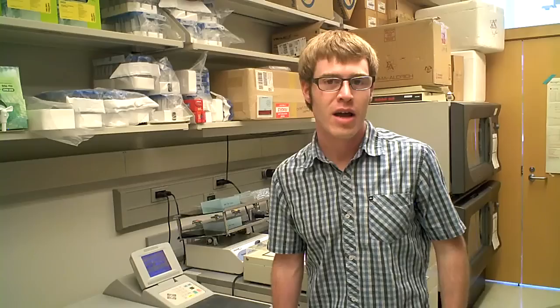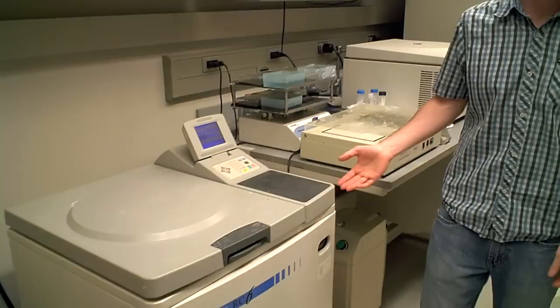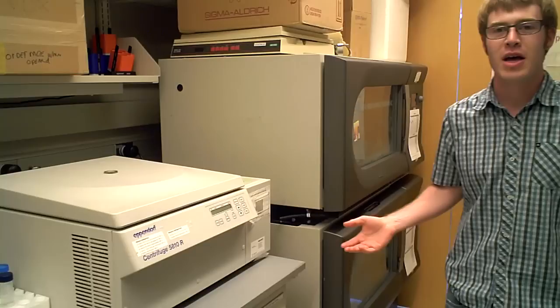In this room we have a lot of the workhorses of the lab. We have our large centrifuges for spinning down cultures and cell lysates. Our tabletop centrifuges for concentrating protein and spinning down samples. And then over here we have our large scale incubators for growing up protein cultures and bacterial cultures.